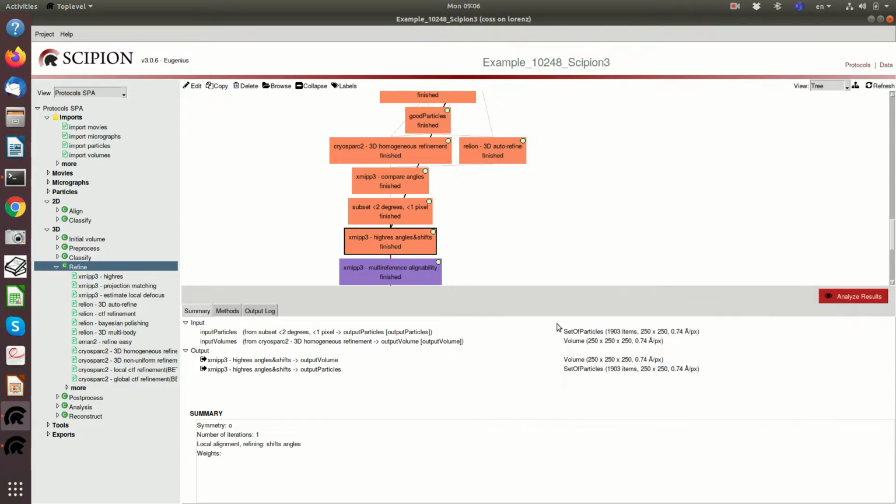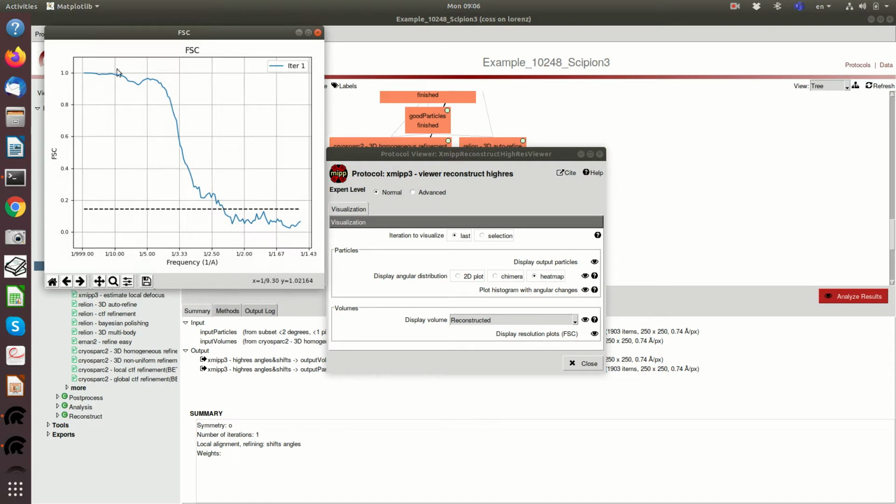And then the output of this has this FSC. This FSC from high res is fighting noise a lot. So outside the structure, it identifies those areas that are candidates to be noise, and they are dampened. So the 2 halves are very consistent with each other, but it doesn't mean that we really have this extremely high resolution.